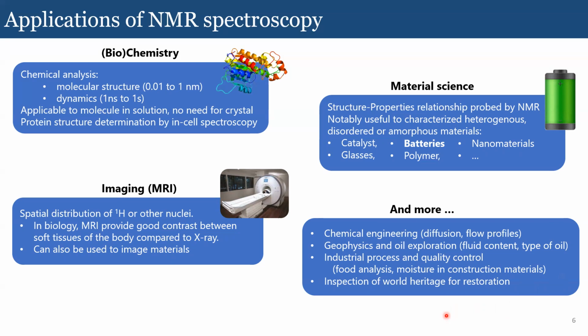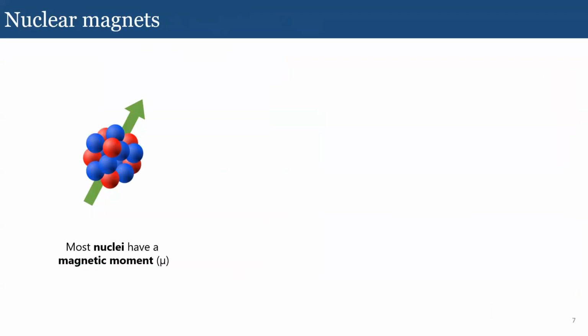Yeah. So now I'm going to try to make it simple and concise with the fundamentals of NMR theory. But if something isn't clear, feel free to stop me. Like I said, we're going to have to talk about the basics, and this starts with the concept of nuclear spin. It's a fairly difficult concept, but it's fundamental, as it is actually what we observe in NMR.